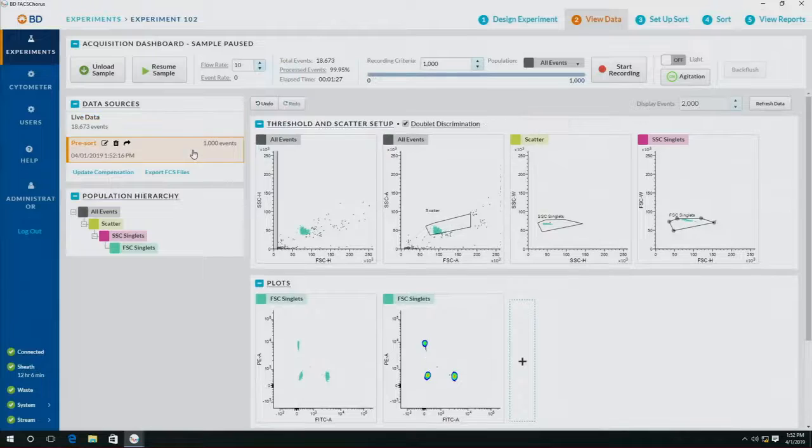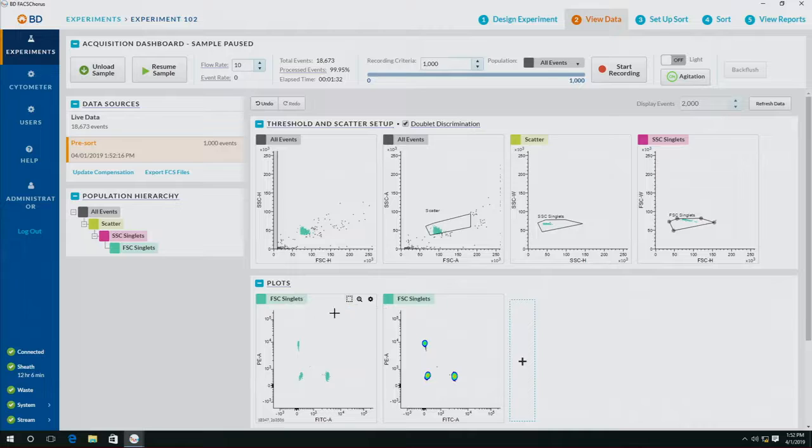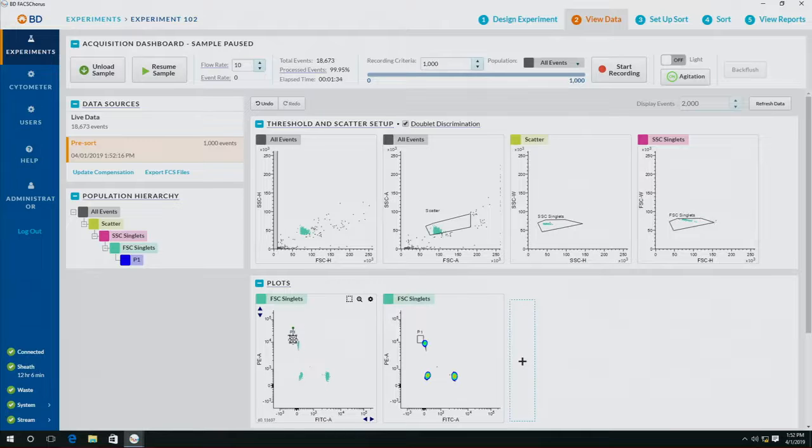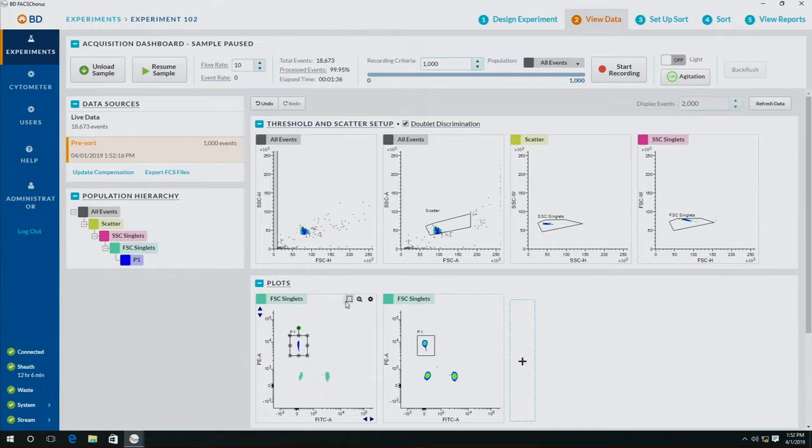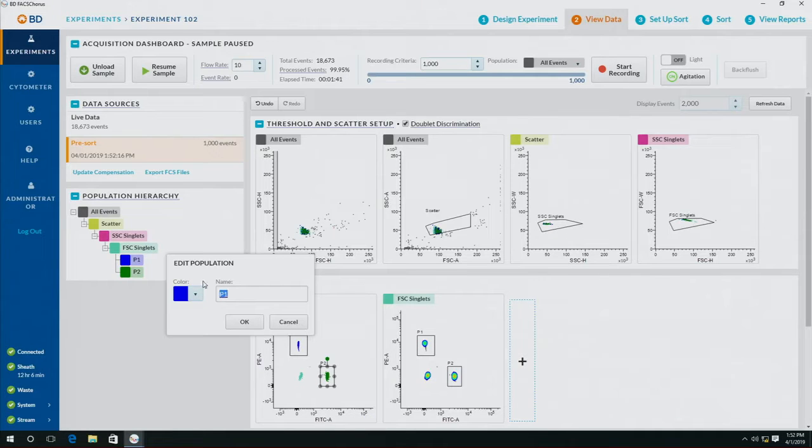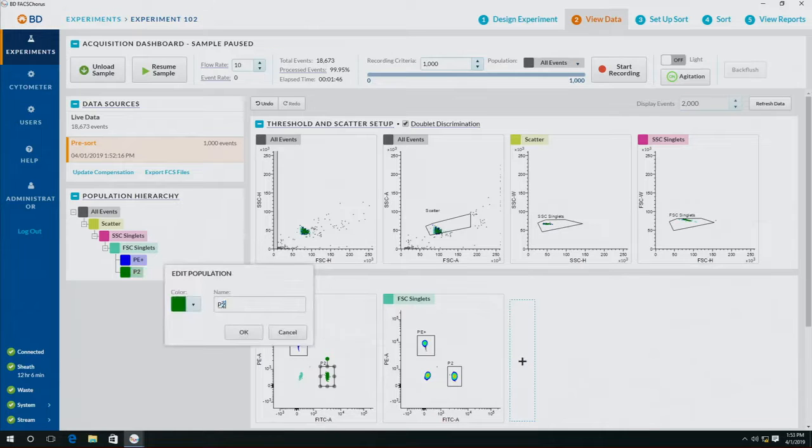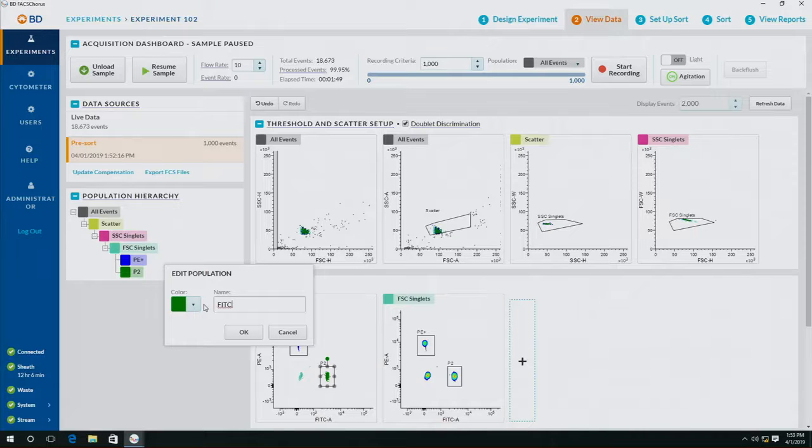Once my sample has been recorded, I'm ready to set up my gates. So in the top right corner here I can select the types of gates I want to use. I'm going to draw one around my PE and one around my Fitzy, and I'm going to relabel them. So P1 is going to be PE positive and P2 is going to be Fitzy positive.